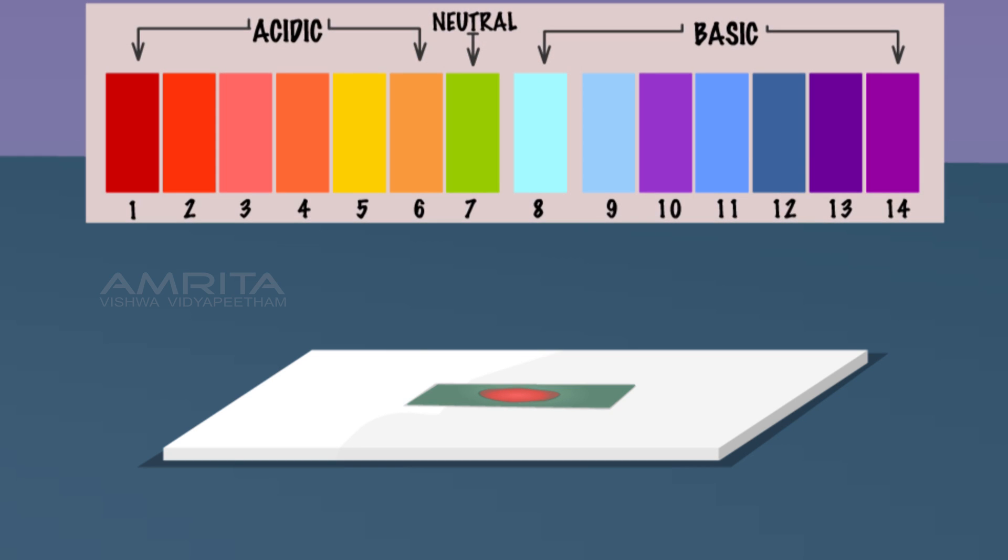Compare the color produced on the pH paper with the different color shades of a standard color pH chart and note down the pH from the color chart. The pH of acetic acid is 3.